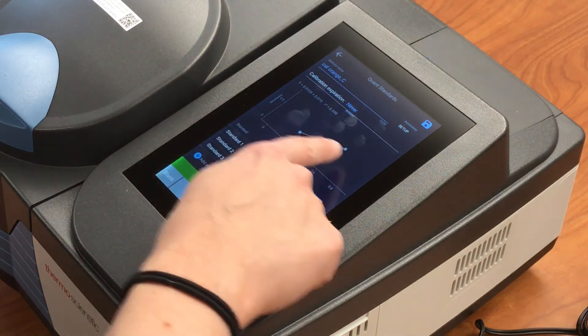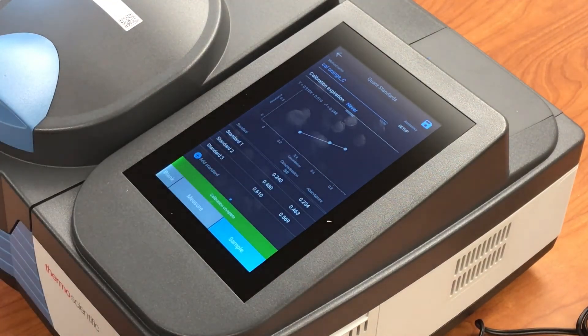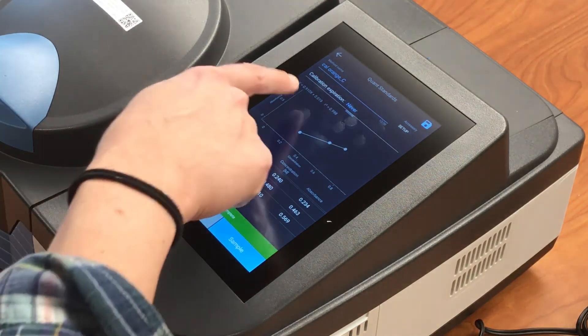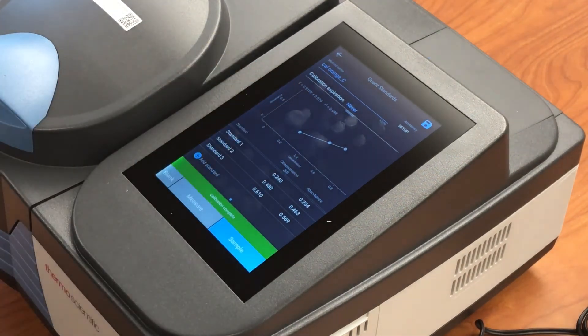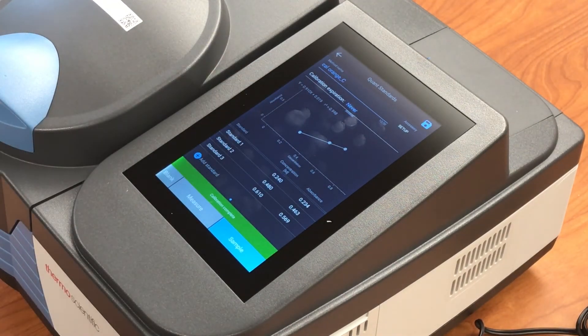You can see the calibration curve that's displayed on the screen, and here it gives you the equation for the line that it has generated.